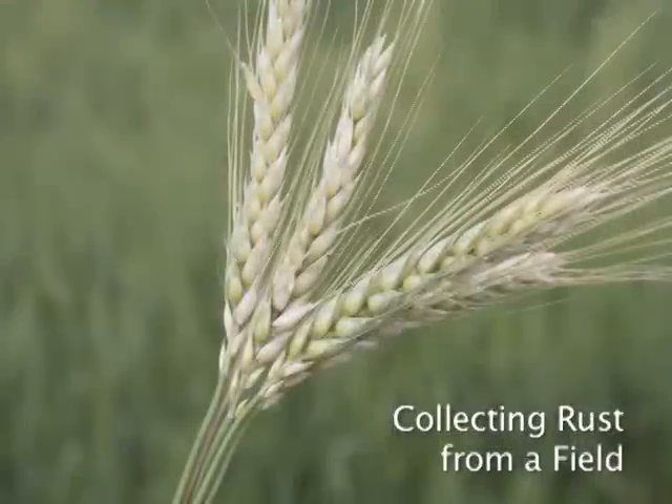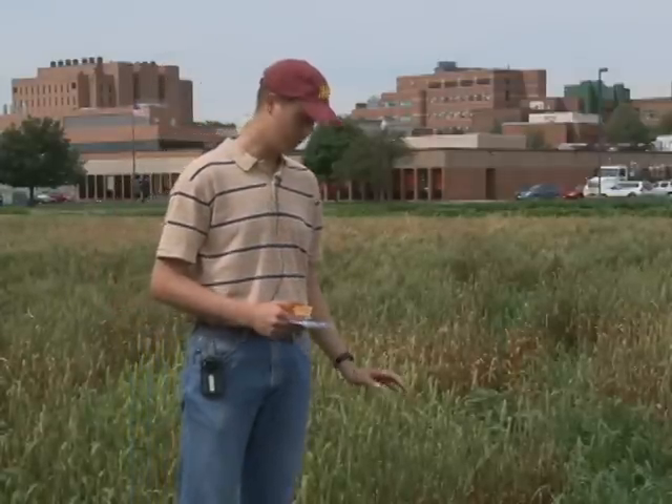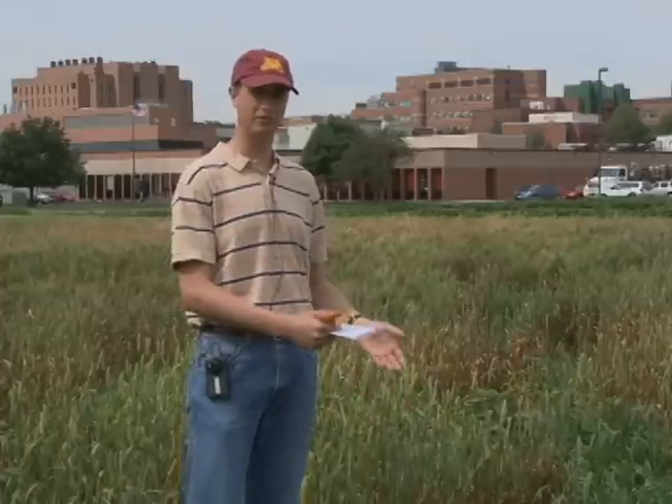Collecting rust from a field. In order to determine what races of stem rust are present in the field, you need to make collections of the stem rust and then bring it back into the greenhouse. We're here in the field and we have wheat that's infected with stem rust. We're going to make some collections and then bring it back into the greenhouse to see what races are present.